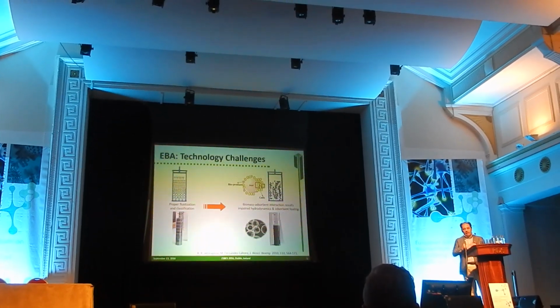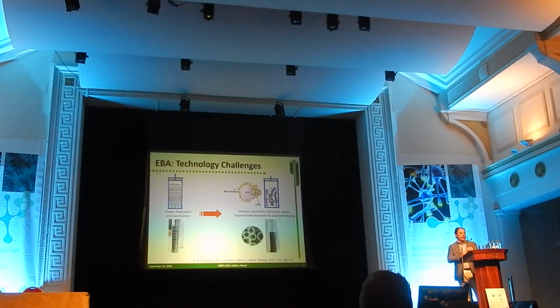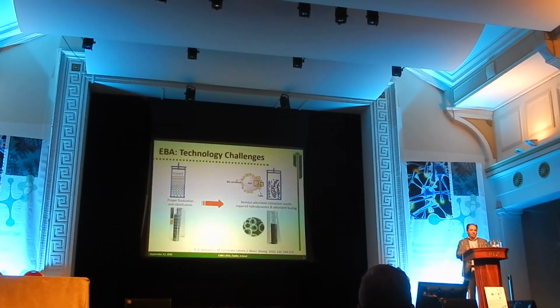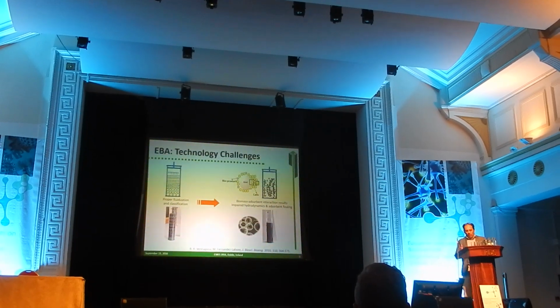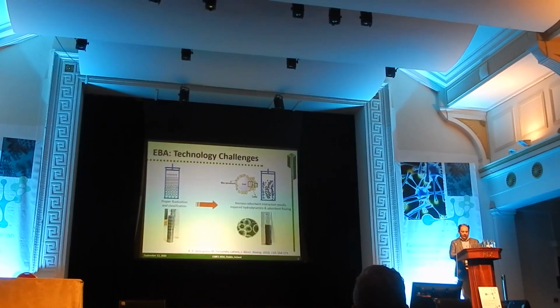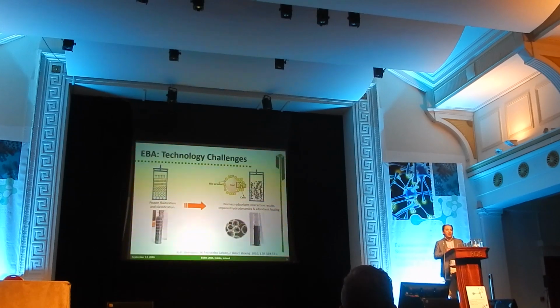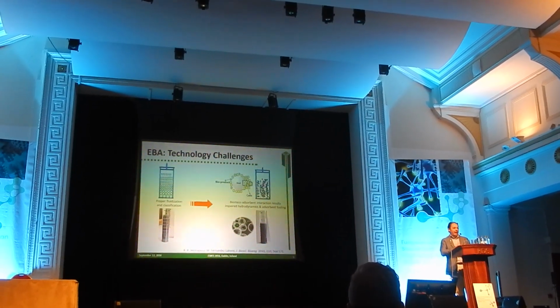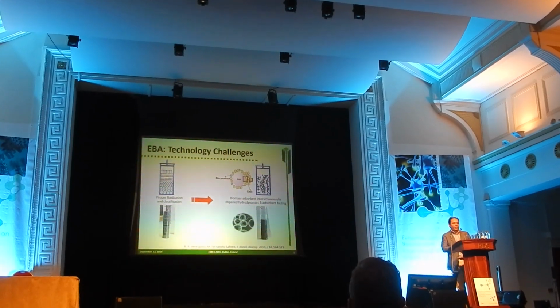So with this relative immobility, so to say, of the particles, we are mimicking what we see in a packed bed column. And when we are mimicking what we see in a packed bed column, we are going into the concept of having several plates or several tanks or several stages of equilibrium.